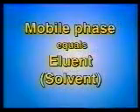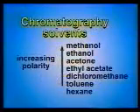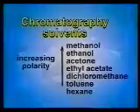The mobile phase can be any solvent or mixture of solvents that will move the compounds on the solid support. Eluting solvents of various polarities have differing abilities to displace solute from the active sites of the stationary phase. Generally, the more polar the solvent, the more efficiently it competes, and the more quickly the solute will move up a TLC plate. This property, the ability to displace solutes from adsorbents, has produced a list of solvents in order of polarity which serves as a guide for choosing a solvent for a particular separation.